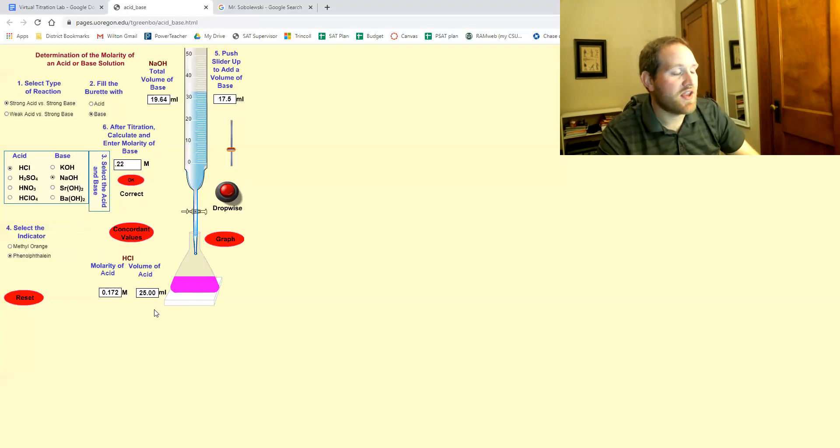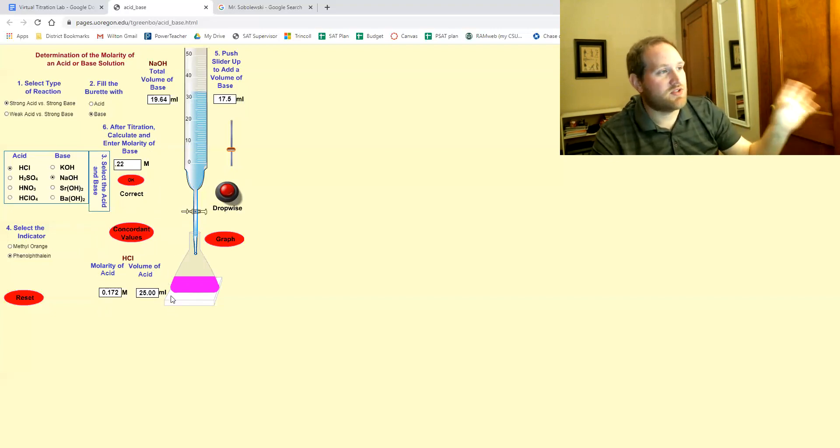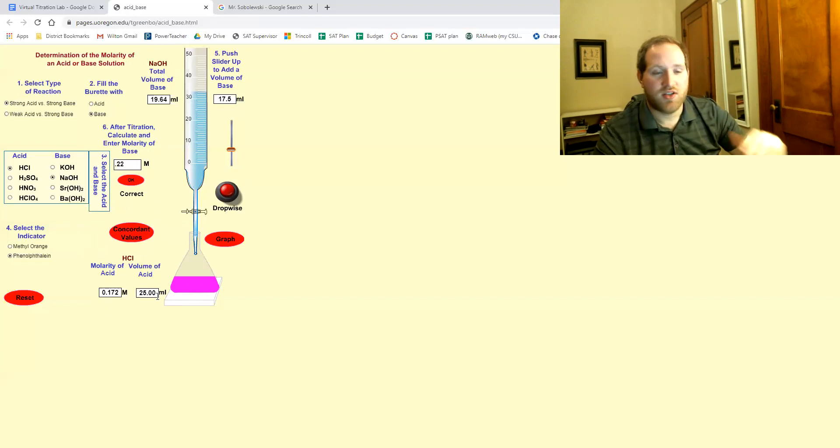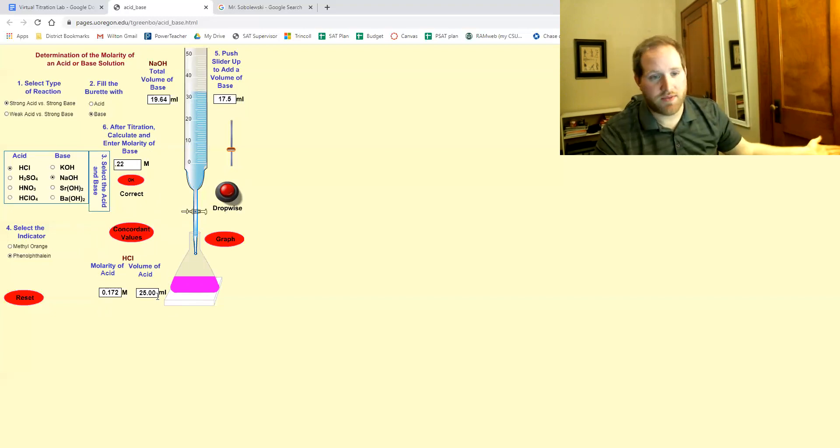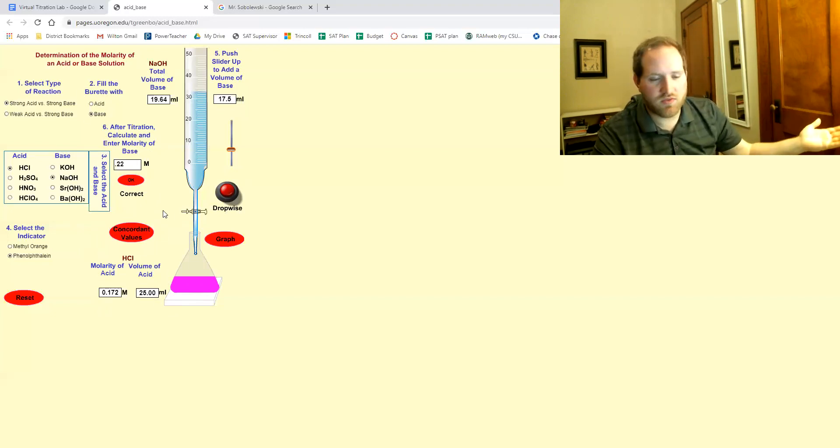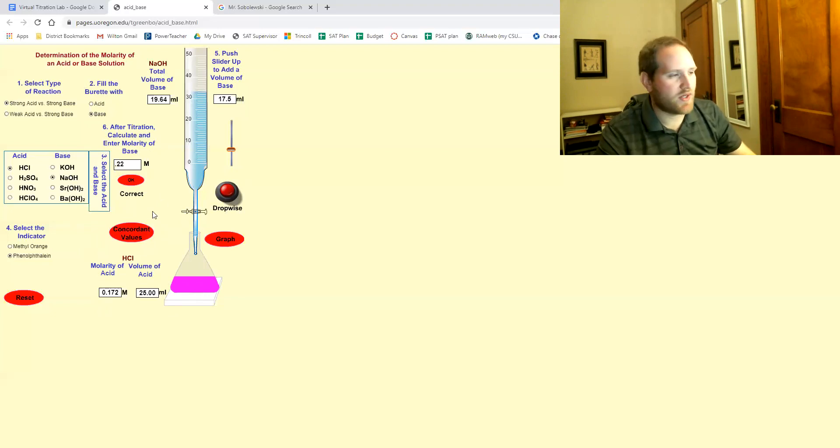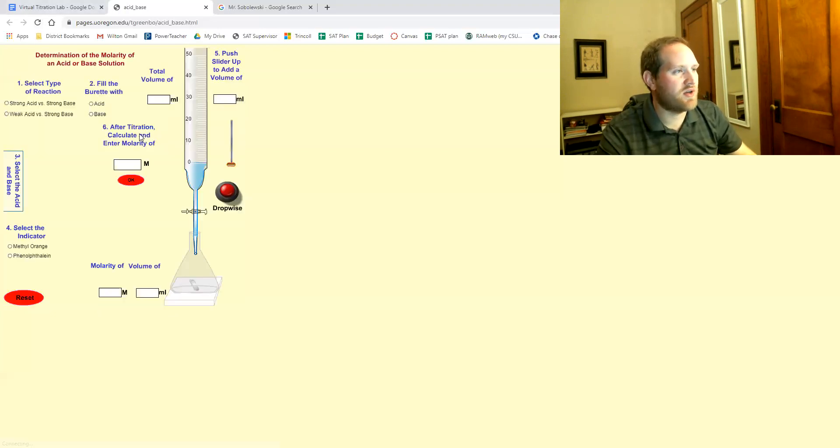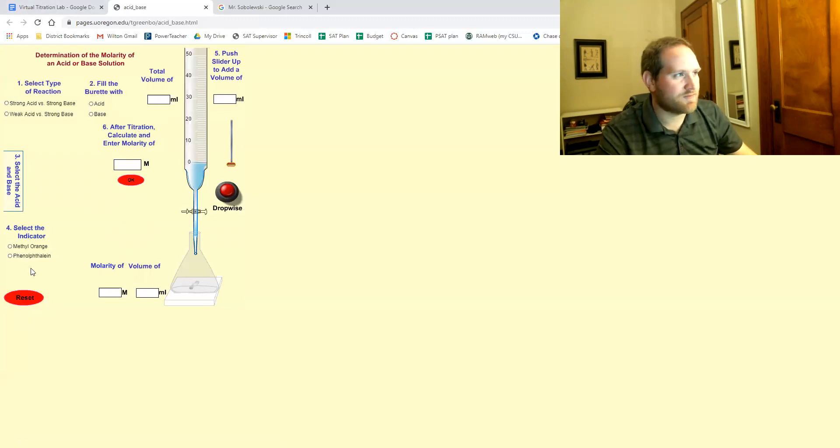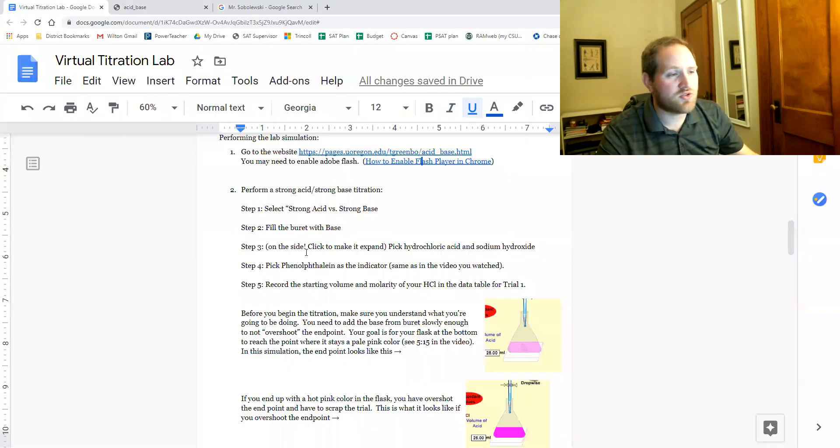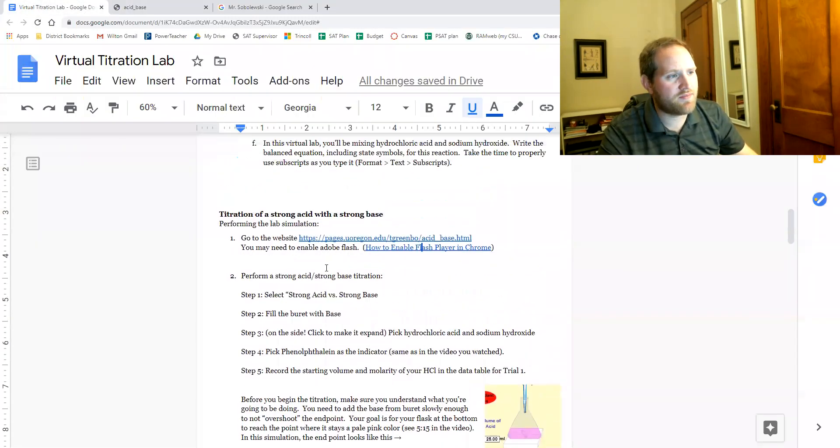hopefully not with this video. So take your time. And basically once you're done with this, you're going to do trials two and three. Now, once you get it once, it's pretty quick to get a second time. So you can either just refresh the entire window. I would just do that, or you can hit reset, but sometimes it does kind of glitch out.